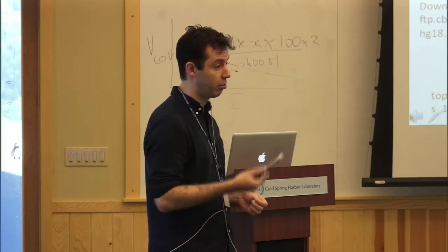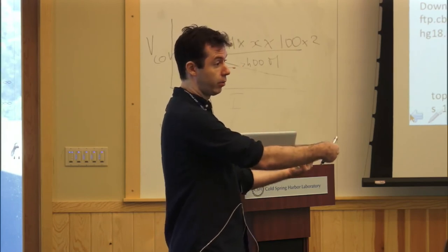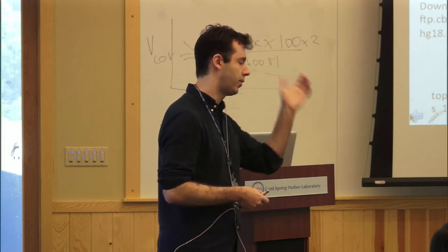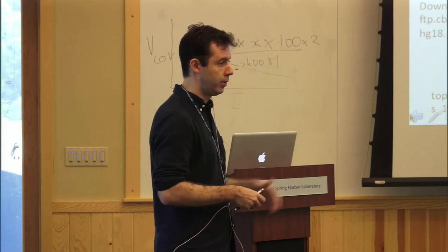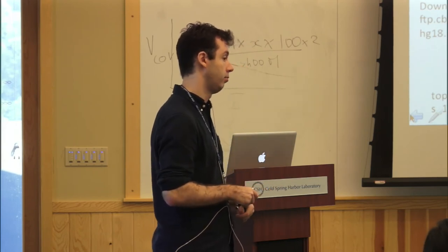Because we thought we had the right number, and then we did it again with a different number, and we got a different result. That's why what we do is estimate that number for every RNA-seq run. We estimate it by mapping short reads to RefSeq transcript sequences themselves, and you get an average from this mapping. That's pretty fast because the RefSeq database is a small file compared to a whole genome database. So you can map all your reads to RefSeq transcripts, get the average insert size, feed that into TopHat, and you can automate the process.